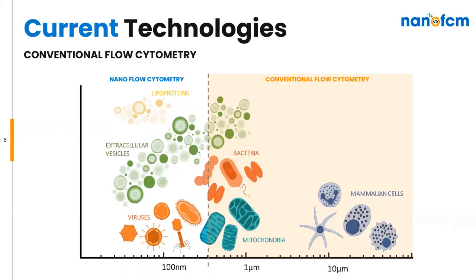So to facilitate identification of these nanoparticles, fluorescent staining is often used to resolve the particles from the background. However, fluorescent signals from nanoscale particles will be orders of magnitude dimmer than that of cells and may be beyond the fluorescent detection limits of conventional flow cytometers. Additionally, this detection method may lead to the inclusion of false positives such as loose fluorophores or degraded membrane.